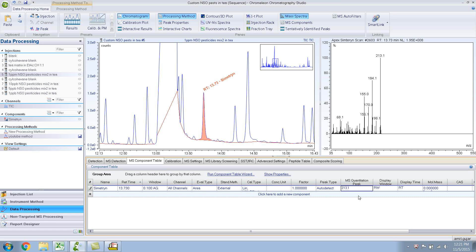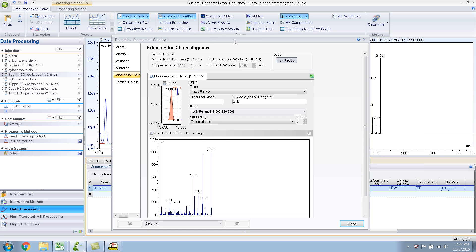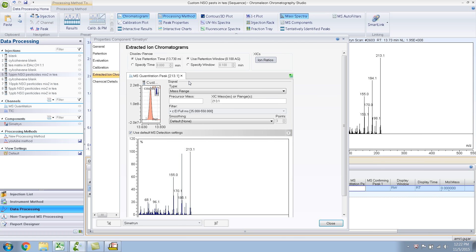If I double-click, there it is — this is the extracted ion. What it does is extract m/z 213 from the TIC and quantitates only on that. You can also add more confirming ions to make sure that Simetryn is really present.